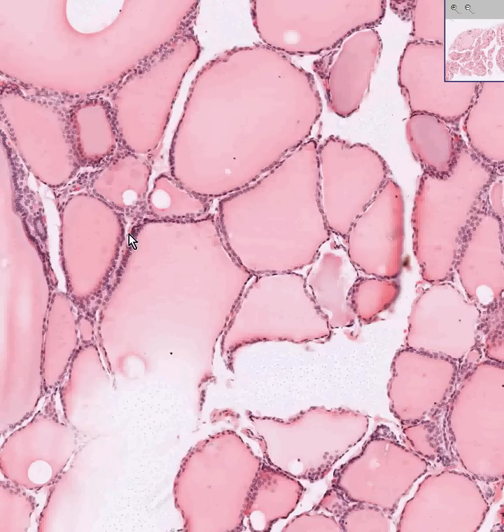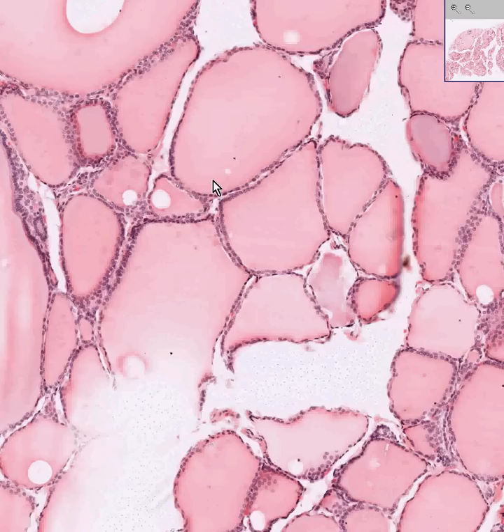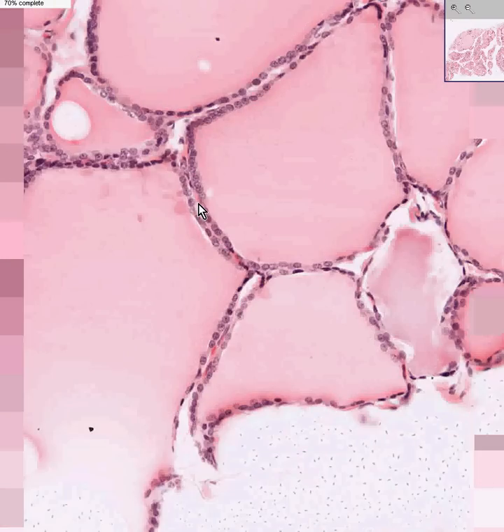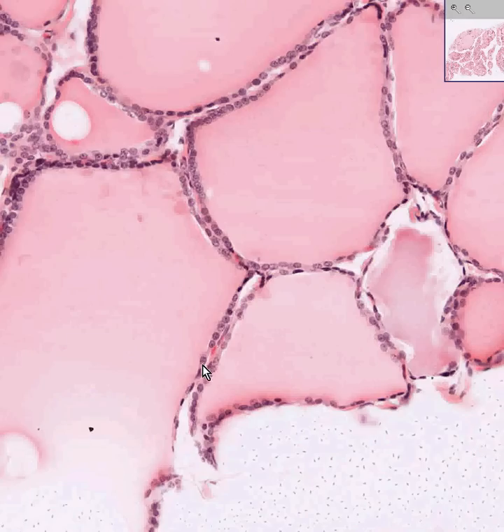The intervening tissue between the follicles — the interfollicular connective tissue — is extremely vascular. Even in these tiny little septae between adjacent follicles, you will invariably see a nice little plexus of blood vessels, capillaries. There's one, there's one, there's one.